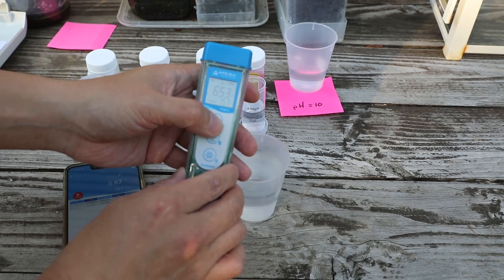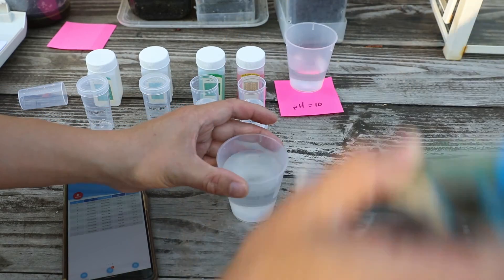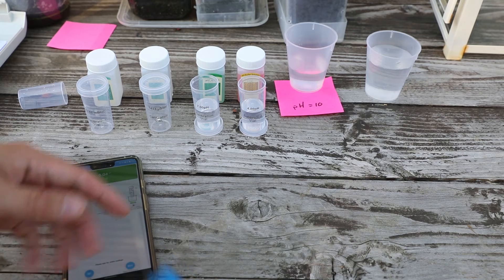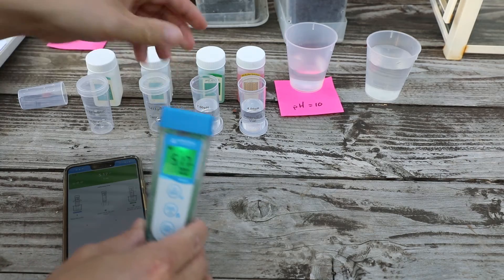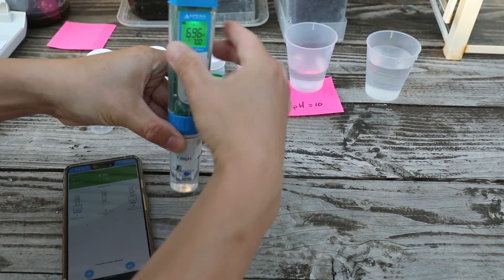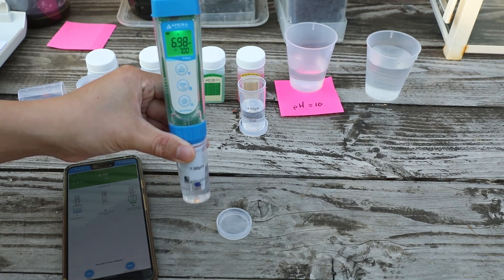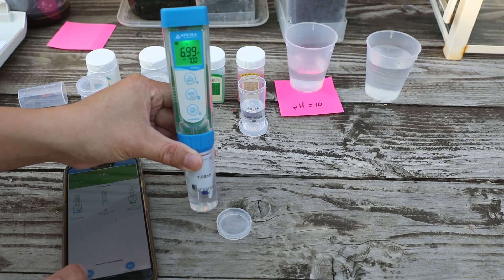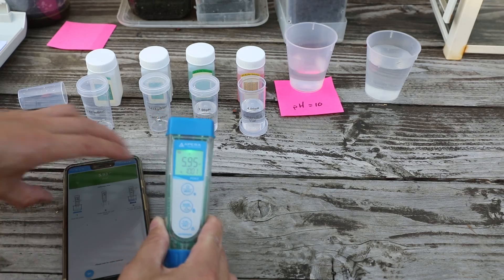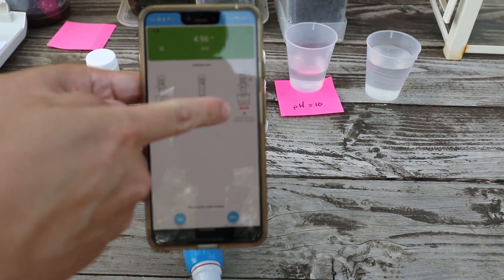When you're ready, move on to the pH calibration. Give the probe a quick rinse and dry off the tip, then grab your starting solution. For the pH tester it always starts at pH 7 for testing. Give it a quick swirl to remove any bubbles and hit enter when you feel confident. Then move on to the next pH — it'll flash to show which other pH calibration standards are available, in this case low and high pH variables.